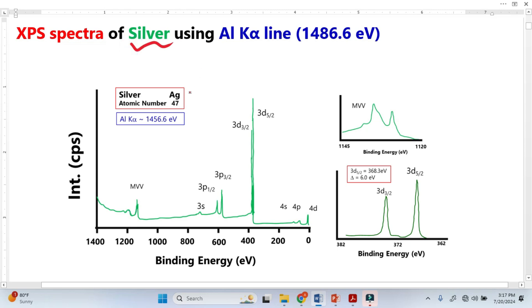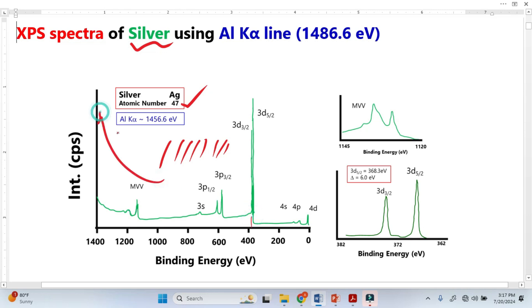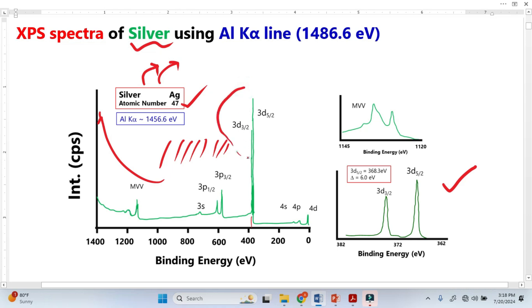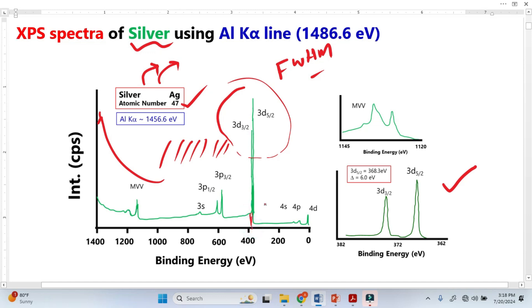Now looking at a similar spectra for silver, which has atomic number 47 — this is the survey spectra. It gives us information about the elements, and we identified from the binding energy table that this spectra belongs to silver. Now we are interested to know whether this silver is making a bond with other elements and what is the environment of this silver. So we take the high resolution spectra and focus on the most important peak. Although the peaks are already somewhat separated, we cannot accurately determine the full width at half maximum, the intensity, or the exact peak position — this is why we need high resolution spectra.